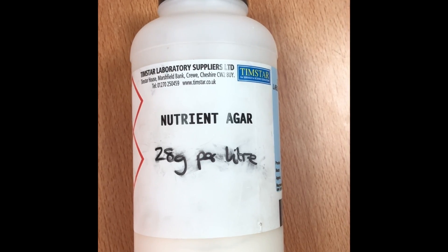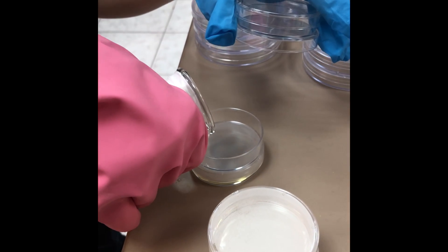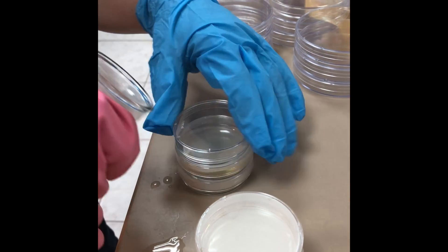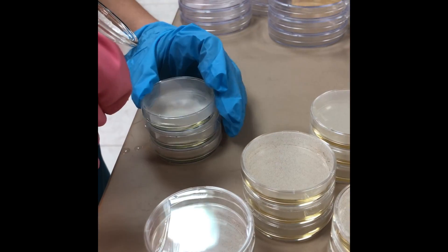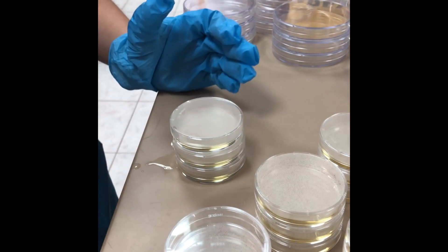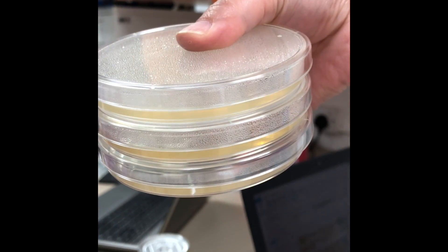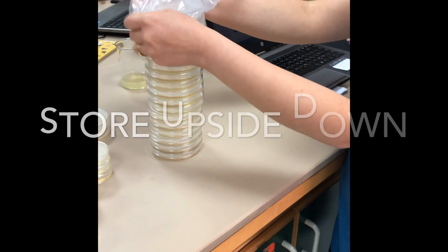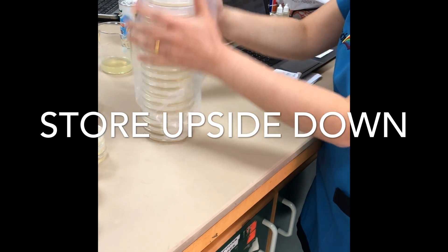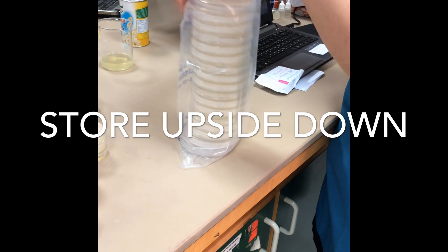To make the agar jelly, take 28 grams and dissolve it in a litre of water. Heat it up until it completely dissolves, then quickly pour it into petri dishes and put the lid on to avoid contamination. It doesn't take long for the agar jelly to set. Because we poured it in while it was still warm, some moisture accumulates, but that's okay — we store our petri dishes upside down so the moisture won't sit on the agar jelly.